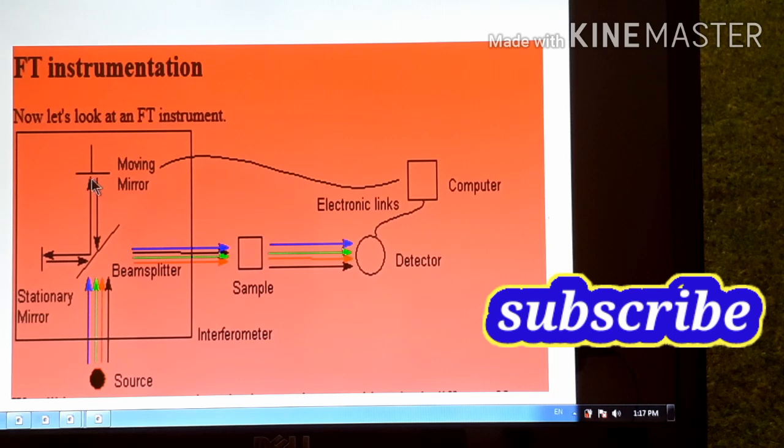When the radiation reaches these mirrors, it is reflected back and recombines at the beam splitter. But in case of the moving mirror, when these radiations reflect back, constructive and destructive interference can occur, based on the change in path length. When the radiations reflect back from the moving mirror and the stationary mirror and recombine at the beam splitter, they are directed towards the sample. These radiations are now a diverse beam having diverse frequencies and wavelengths. These radiations are known as the interferogram.